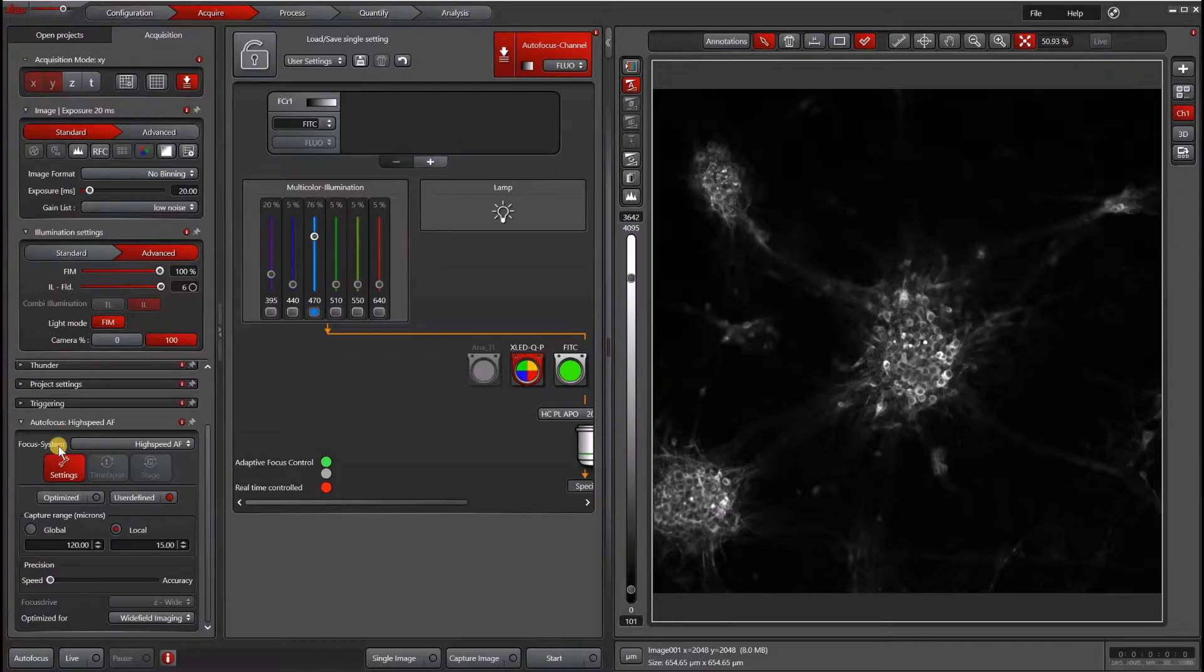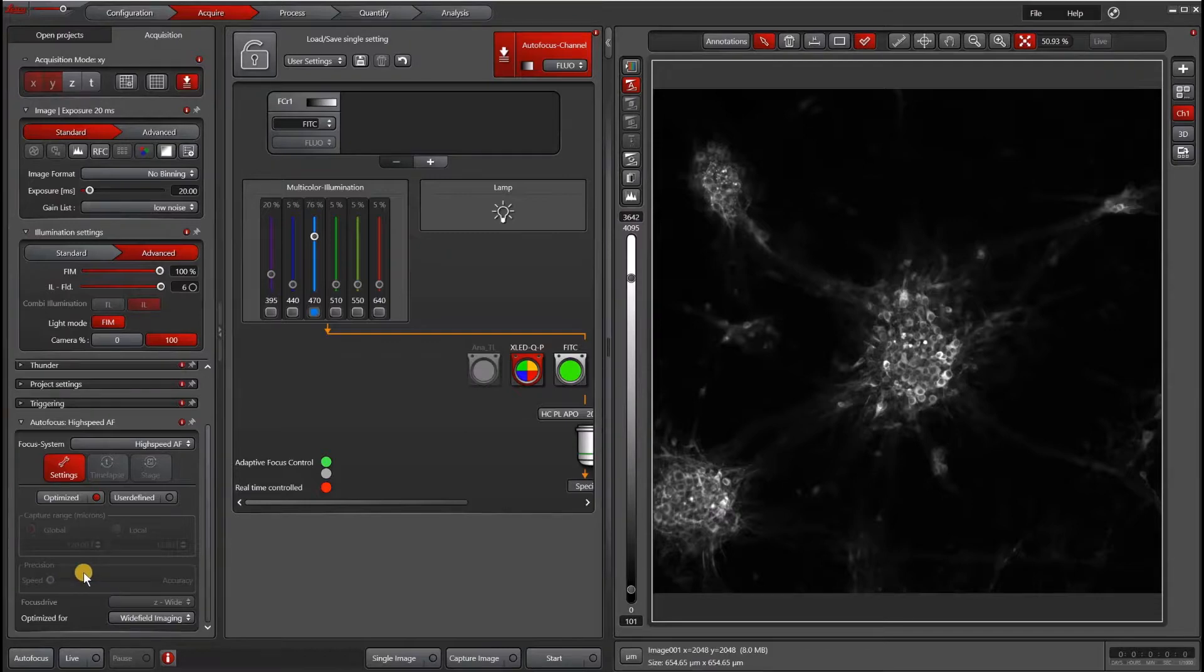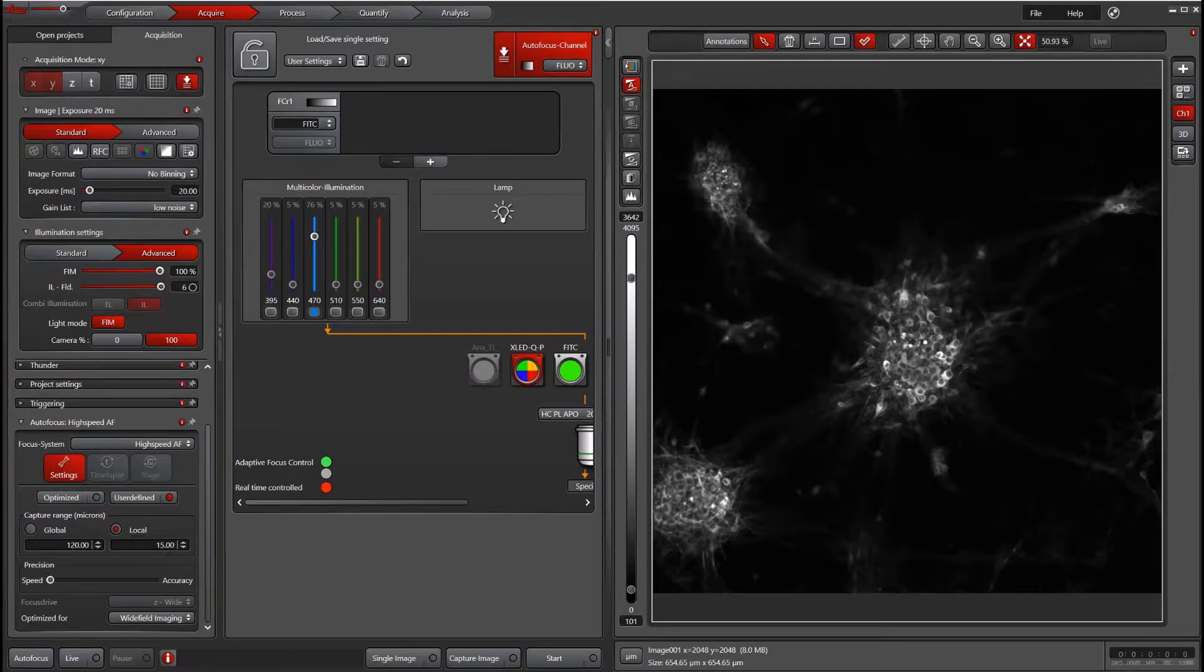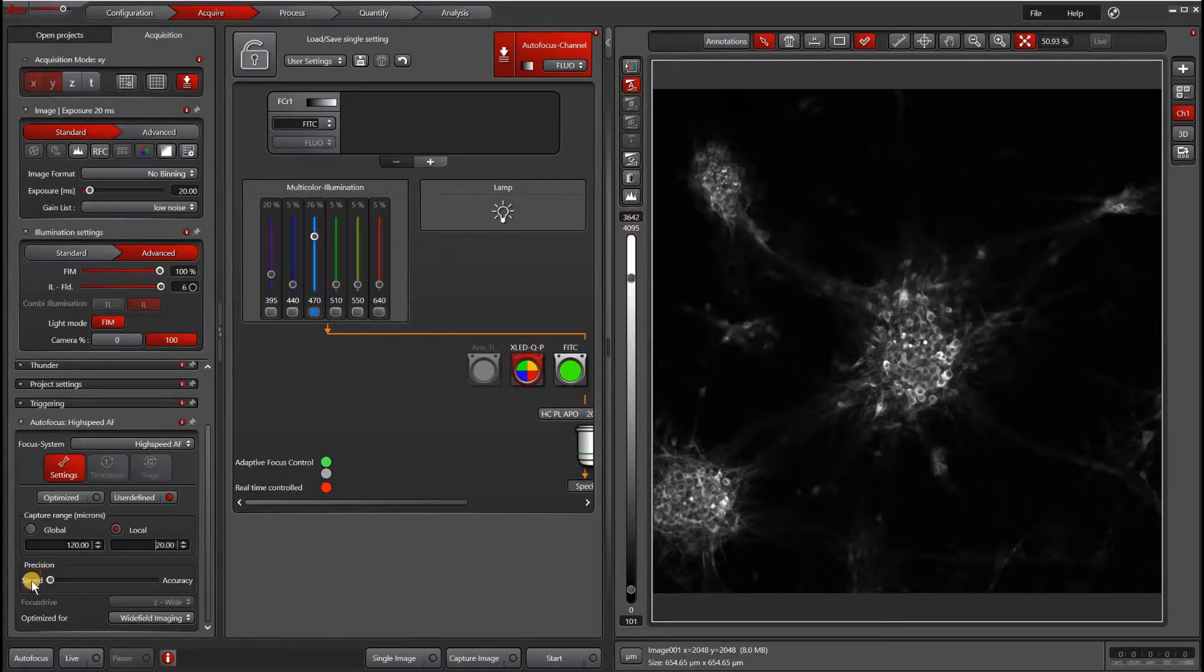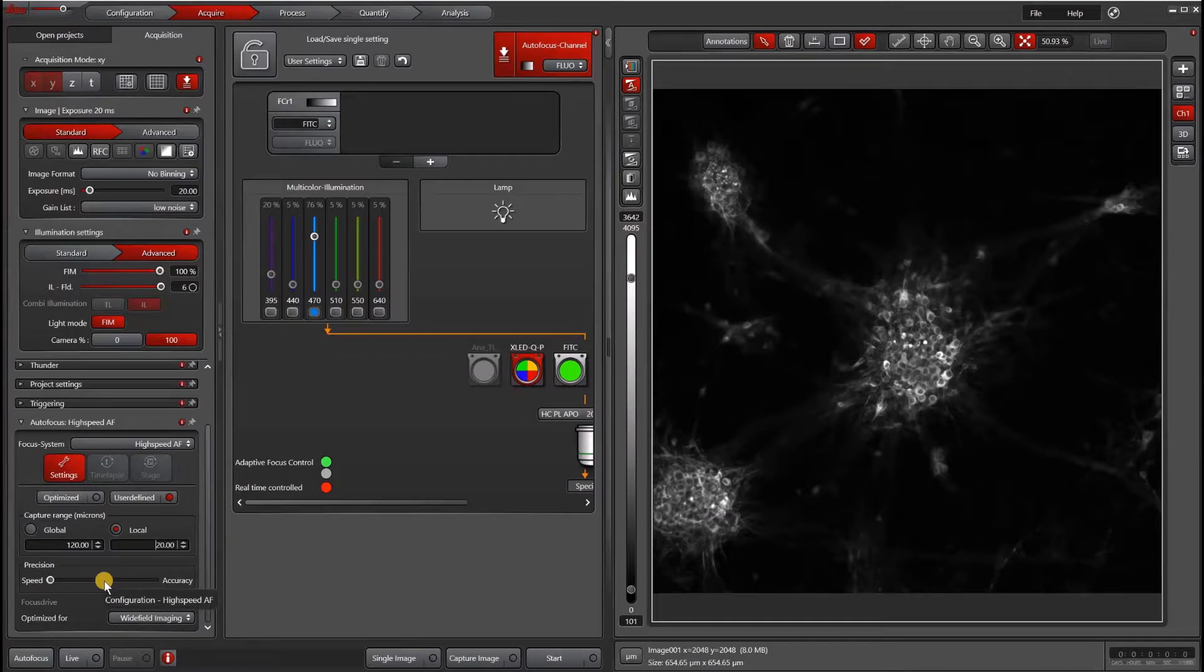If I go back to my autofocus window, you can now select between optimize and user-defined. Optimize will be just some generic settings, which by default is usually optimized for speed. I like to go into user-defined and either choose global or local. For the range, it depends on my sample. If it's fairly flat, then I will choose local. If it's thicker or wavy, then I will choose global. Usually I look through something around 20 to 40 microns, though it varies a lot depending on your specimen. Next for the precision, high speed means fewer Z slices and high accuracy means more Z slices. Usually I go with something in the middle and that gives me a good result. You do want to choose wide field imaging for your optimization.